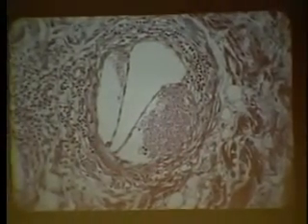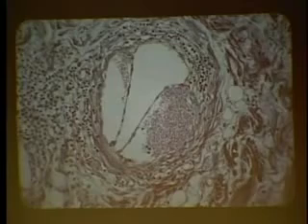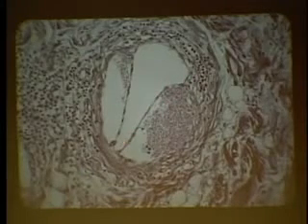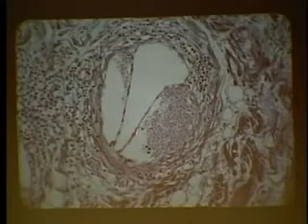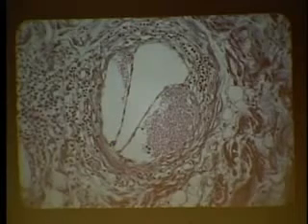New slide. What is it? It's a blood vessel, yes, but what kind? A vein. And how do you know it's a vein immediately? It has valves. Right. So, what kind of cells line this valve? Endothelial cells. But when we classify epithelium, is this stratified or is it simple? It's simple. It's only one layer. One layer in these valves.